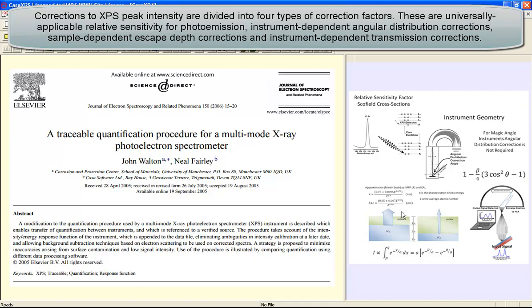There is the escape depth correction that is allowing for sample variation as a function of kinetic energy. That means that the escape depth from which electrons leave the sample without energy loss changes as a function of kinetic energy, and therefore we have to allow for such variations in intensity, especially for peaks such as the magnesium 1s compared to the magnesium 2s, for example.